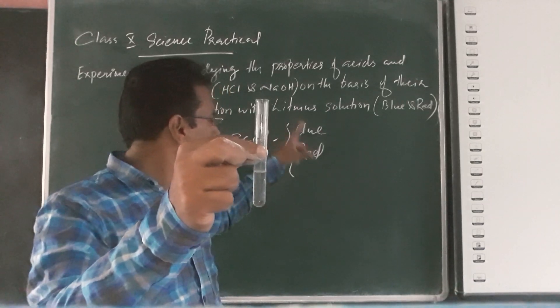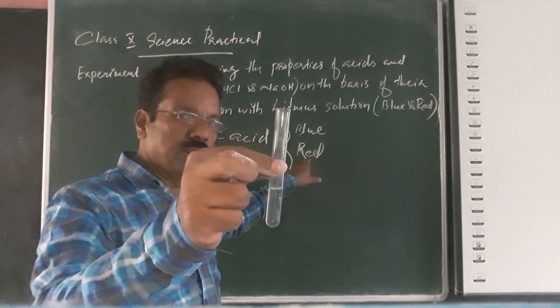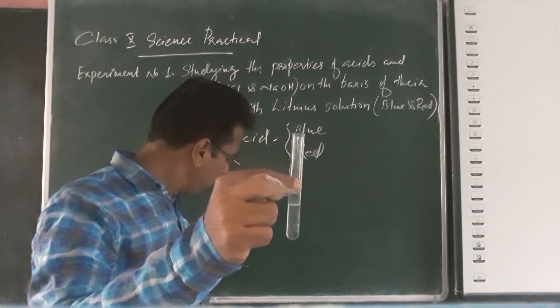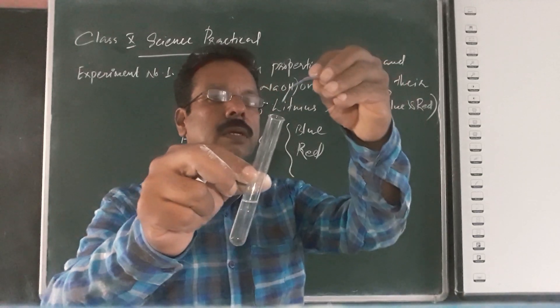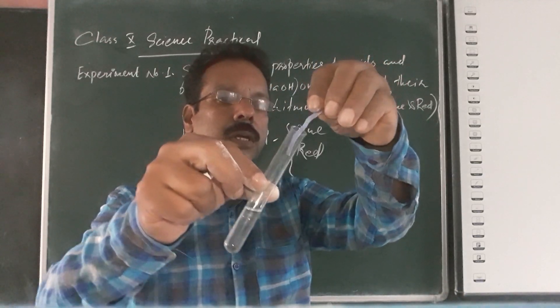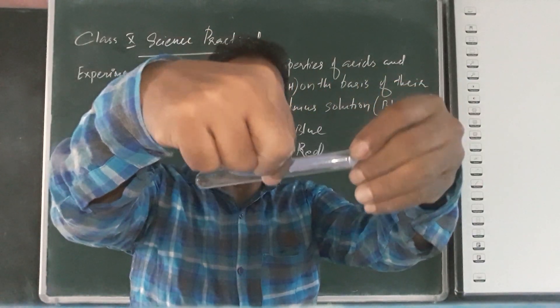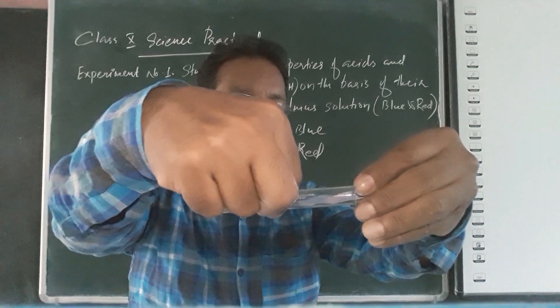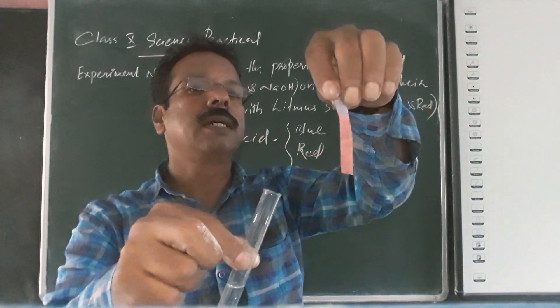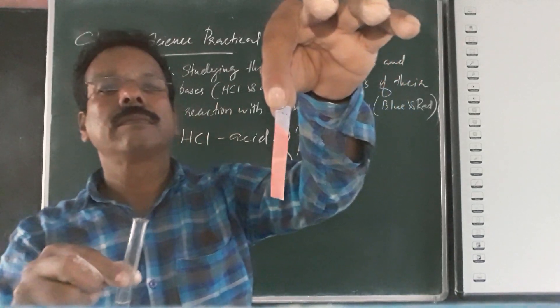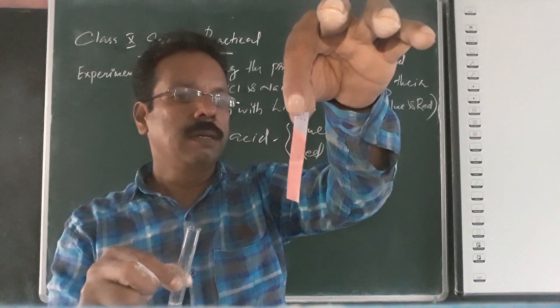Now we are going to test first with the blue litmus paper and the red litmus paper, also blue litmus solution and red litmus solution. First we will check with the blue litmus paper. Can you see any color change? The blue color changes to red.